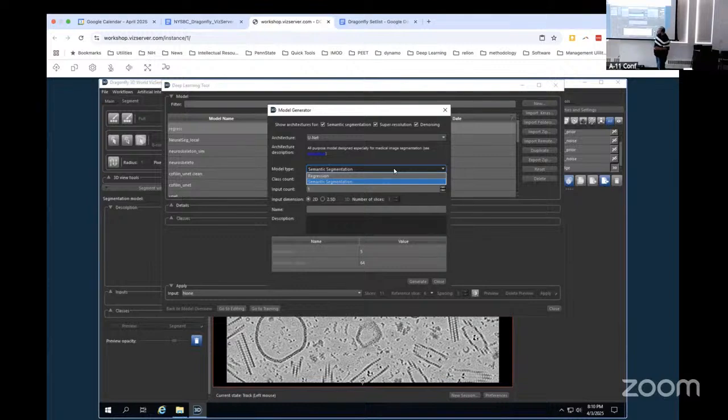It's basically the last layer, the output layer of the neural network chain. I'm going to mess this up, it's been a while since I thought about it. Semantic segmentation, right? The output needs to be some probability that it is that object or this other object. It's making decisions about each voxel, trying to say, is that voxel a ribosome, a microtubule, or whatever?